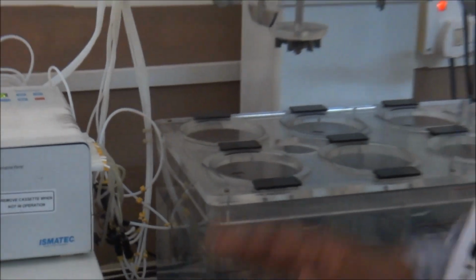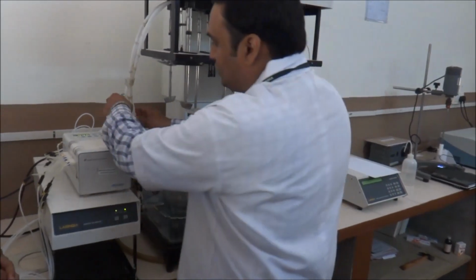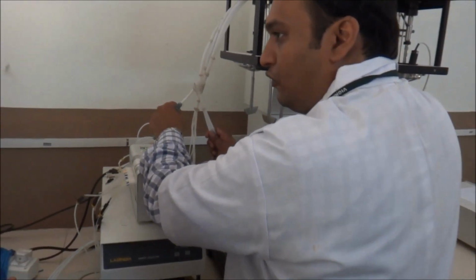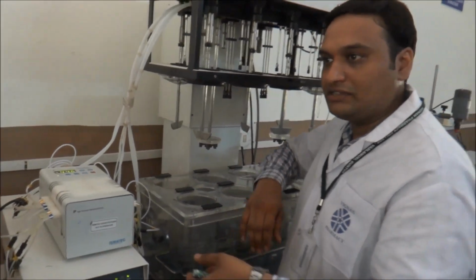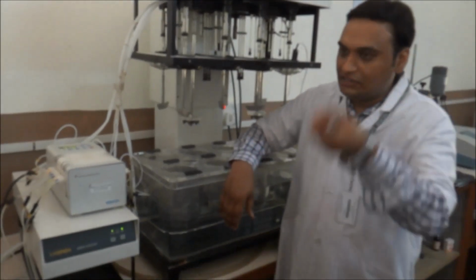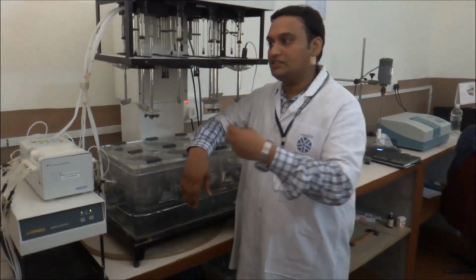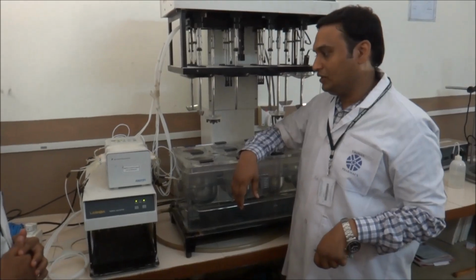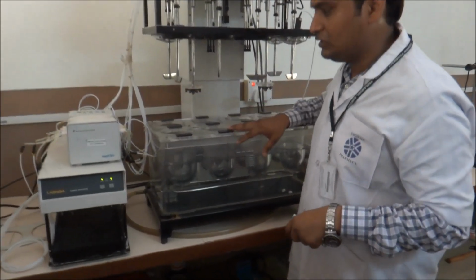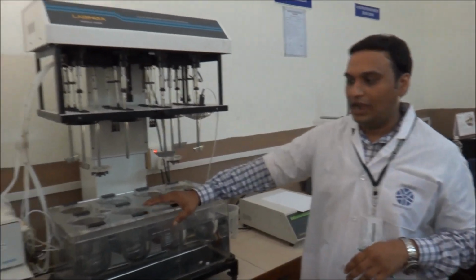So again we have to wash the whole column of these pipes using the buffers that we have placed in the 7 and 8 end baskets. These 2 pumps are one for inflow and one for outflow of the sampling system. Whenever you take a sample from the automatic sampler, it is going to rinse the whole tubules every time, assuring that there is no cumulative concentration accumulated with each sample when coming to the last sample. So this is the basic information about the components of the Lab India Disso 2000 apparatus with auto sampler.